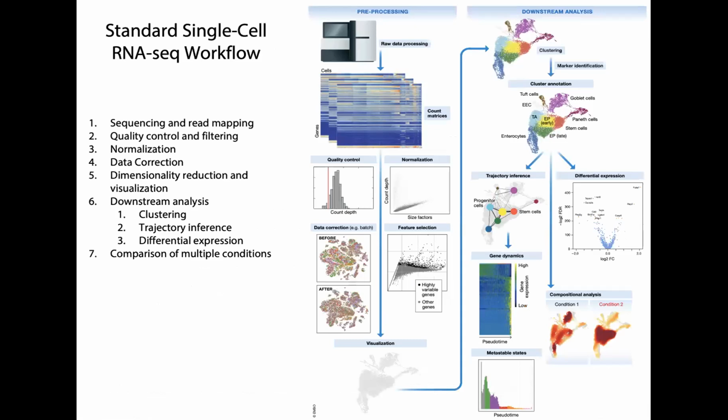The rest of the workshop is going to focus on teaching you the things that come after this pre-processing. Today, we're going to focus mostly on the topics that I mentioned now, but I really encourage you to think about how, if I change some of these things in pre-processing, that is going to change the final results of these algorithms that I'm looking at.